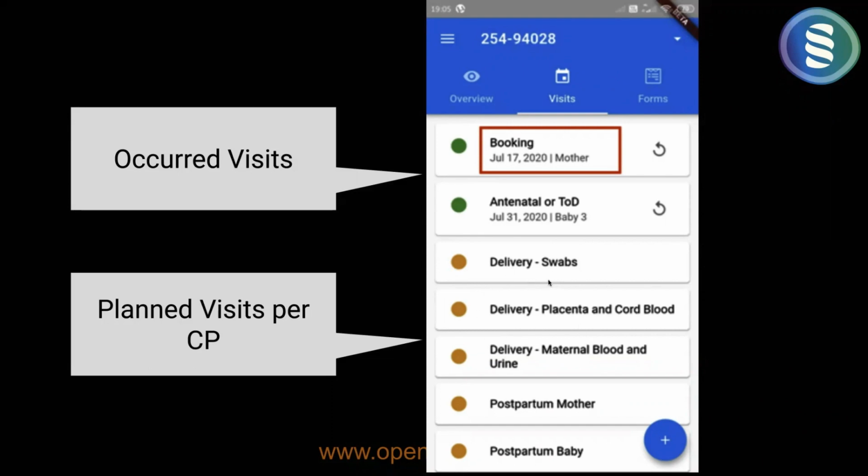This is from the collection protocol definition. You can click on that, see the details, and collect the specimens from there, or you see this icon here, you can repeat an existing event. So if the antenatal event is already done, but for whatever reason the patient has come back and you need to recollect specimens or discard the specimens, etc., you can do all these kinds of things.